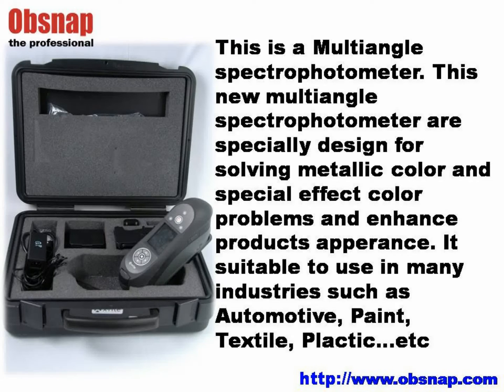This is a multi-angle spectrophotometer. These new multi-angle spectrophotometers are specially designed for solving metallic color and special effect color problems, and enhance product appearance. It's suitable to use in many industries, such as automotive, paint, textile, plastic, etc.